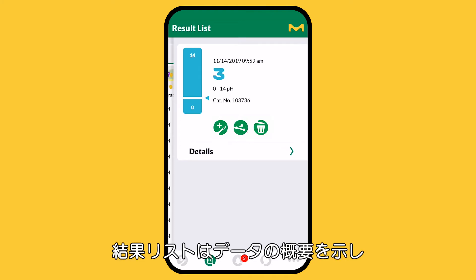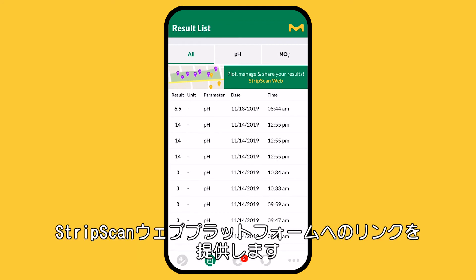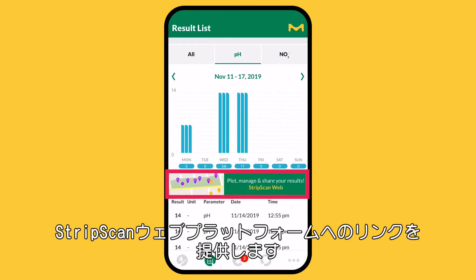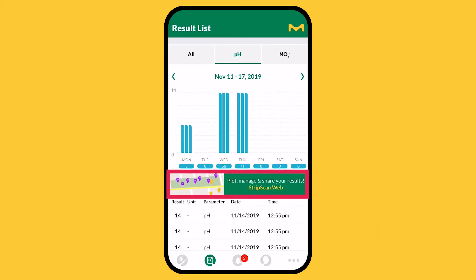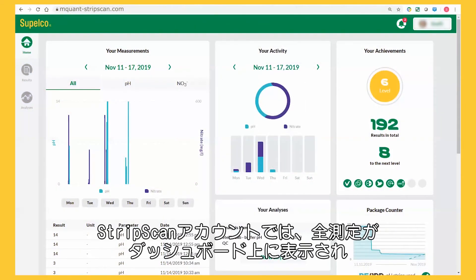The result list provides an overview of your data and links to the StripScan web platform. Through your StripScan account, the web platform synchronizes all your measurements on a comprehensive dashboard.